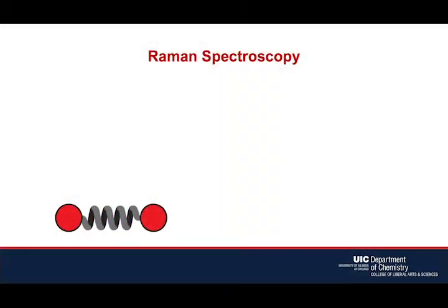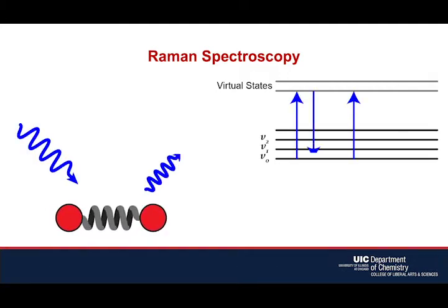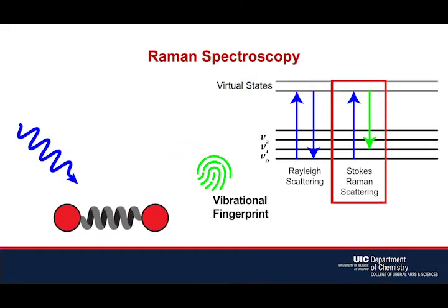In contrast, optical-based spectroscopies, such as Raman spectroscopy, can provide chemical information based on a vibrational fingerprint in nearly universal conditions. However, Raman scattering is a very weak process. Only about 1 in 10 million incident photons are scattered inelastically. Therefore, as an ensemble-based measurement, it does not readily lend itself to fundamental studies at the sub-nanoscale. And so I rely on a method that brings Raman spectroscopy into the near field.